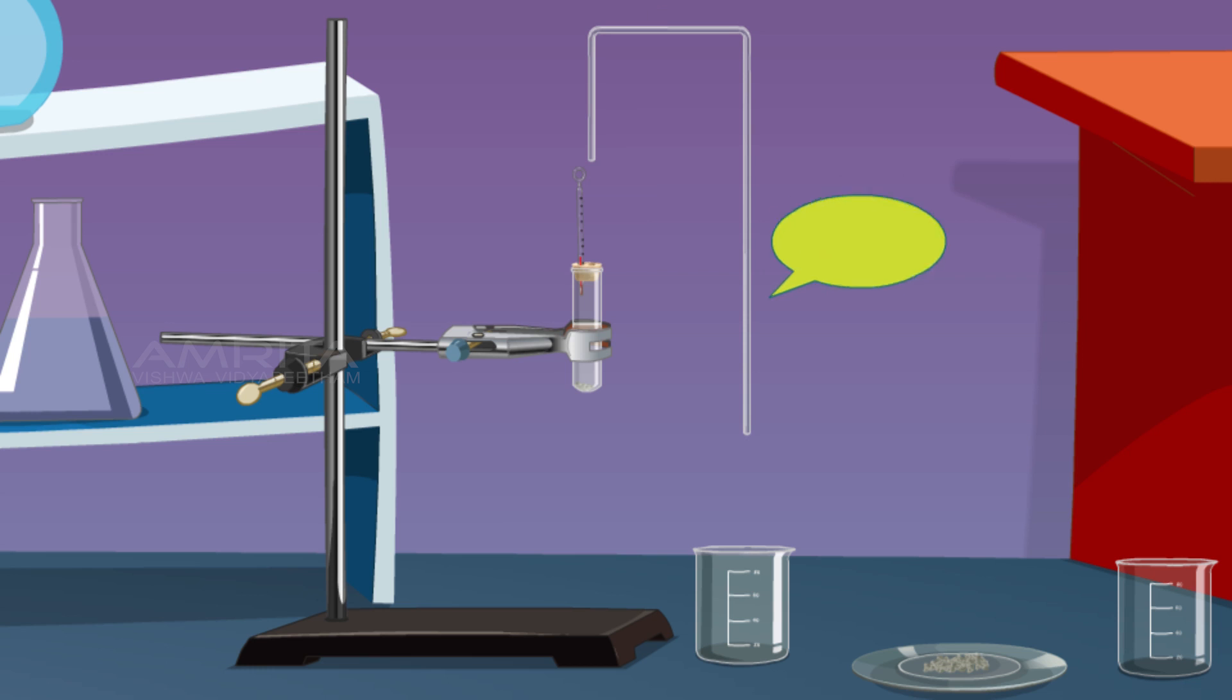Take a delivery tube and insert one end of the delivery tube through the second bore of the cork and insert the other end of the delivery tube into a beaker.